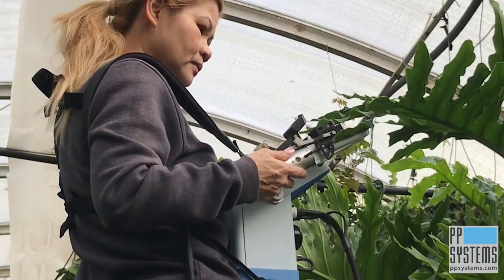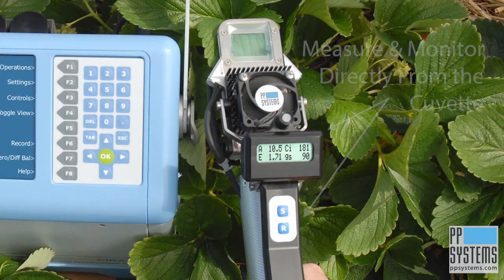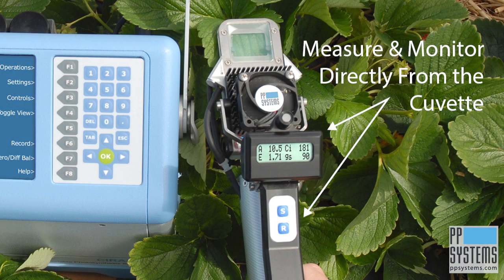The lightweight, ergonomic design of the PLC3 universal cuvette allows you to make measurements single-handedly and monitor data right on the cuvette via its built-in LCD display.